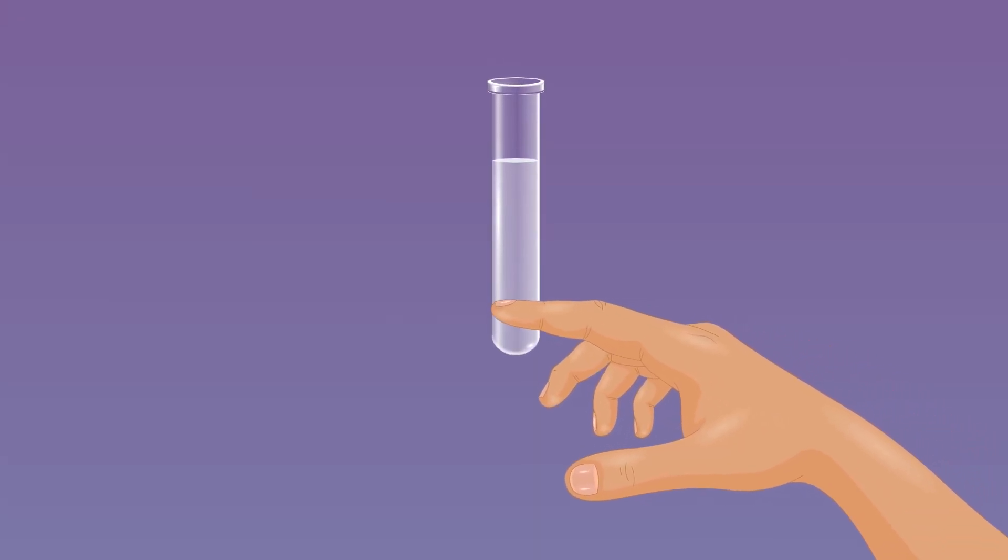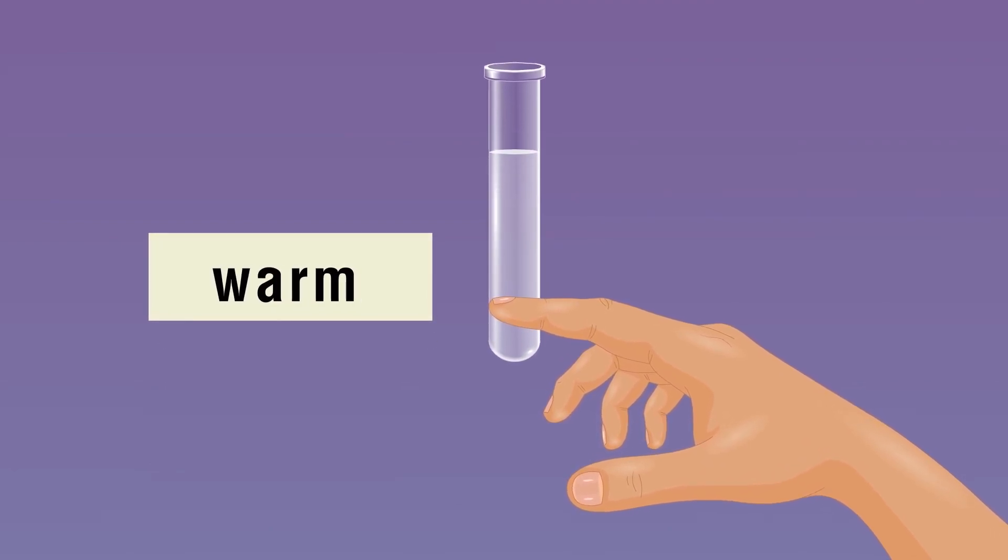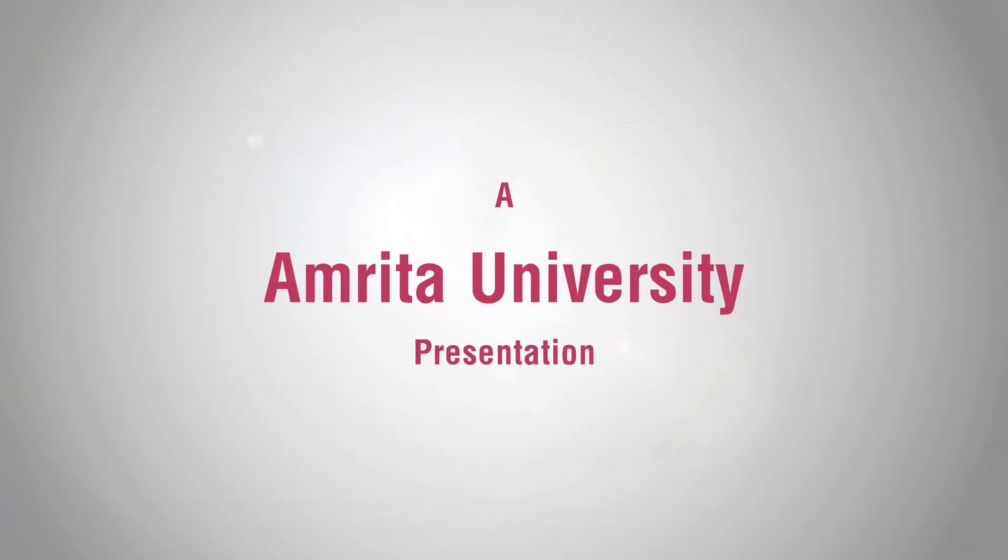Then touch the test tube and feel the temperature — you will find it warm, indicating the reaction is exothermic.